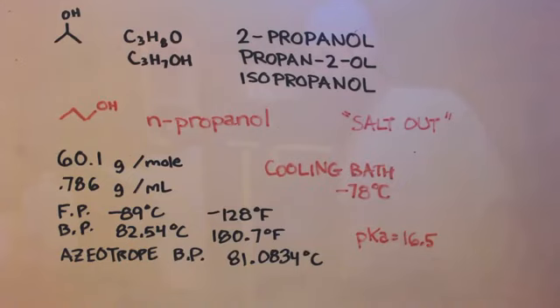So if you throw some sodium chloride in there until it all dissolves and you still have a little bit laying on the bottom, so that you know it's saturated, it'll form 2 different layers, and then you can use a sep funnel to get it out. But you will have trace amounts of water in your alcohol still, and you will have lost some of your isopropanol. I'm sure some of it will go into that salt water. I don't know how much, but that's always an idea.